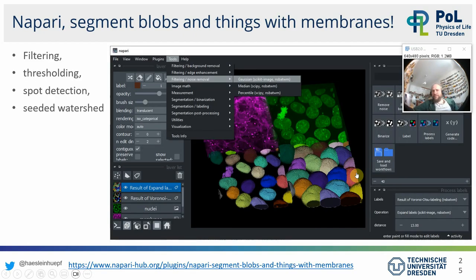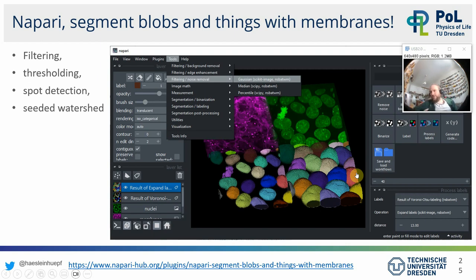There is a Napari plugin called Napari Segment Blobs and Things with Membranes — named to be self-explanatory. If you want to do classical operations like filtering, thresholding, and seeded watershed — the nice operations we know from ImageJ that are sufficient for a vast majority of image data — you can use this Napari plugin. It's based on scikit-image and brings these basic operations to Napari.